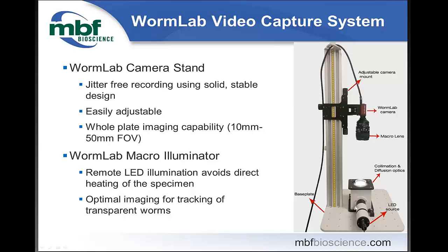There's another question that just came in. Does it work if we use a fluorescence illuminator? This example that you're seeing here is a white LED, and we are working in R&D right now on a fluorescence illumination source for this. That will require additional filters to filter out both excitation and emission spectrum. So that is something we're working on, but what you're seeing right here is a white light illuminator.